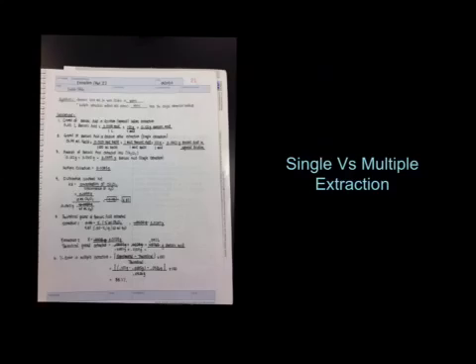In the single extraction, you see here we got 0.0621 grams of benzoic acid, versus multiple extraction, which we got 0.0385 grams of benzoic acid. That means that less benzoic acid was extracted with the methylene chloride in this case, since we have more of it. And in the multiple extraction, less benzoic acid was kept, which meant that more of it was left with the methylene chloride.